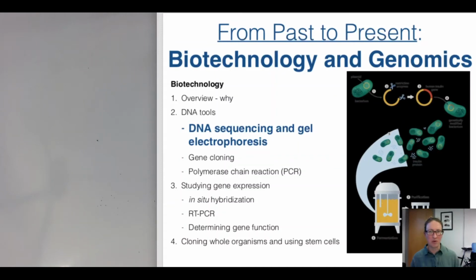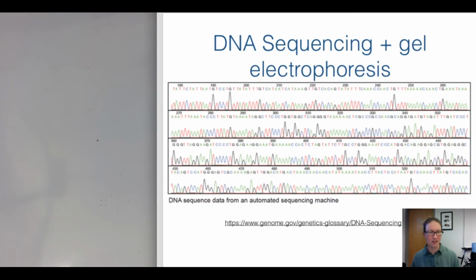All right, in this video, we are going to take a look at the major methods that have been used to sequence DNA. And we're going to start out with a more historic method, and then we'll work our way all the way up to the most contemporary methods that are used to sequence DNA.